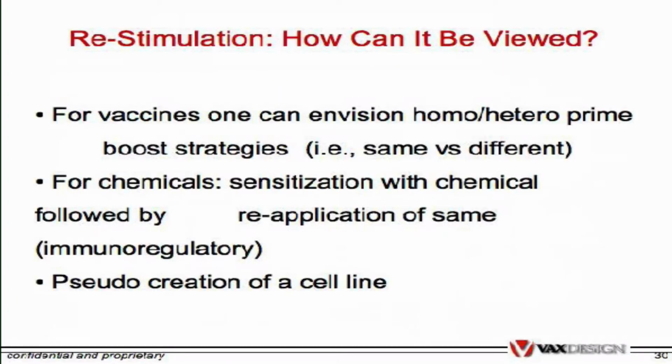We can look at chemical sensitizers. Many chemicals that are used in the cosmetic industry and perfume industry, there's a high degree of interest in whether these are sensitizing or not, allergenic. Hypersensitivities, type 1 and type 4 hypersensitivity, is an area of our interest as well.